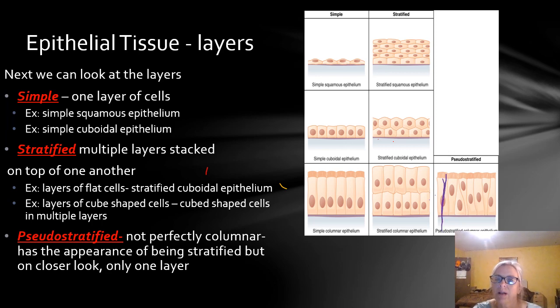These are all one cell here. Each one of these is one cell. It's not divided into cells like this picture here on the other side. So this is pseudostratified, and truthfully it is ciliated, so we would say pseudostratified columnar ciliated epithelium. All right, and so you need to learn what these words mean, and it's really going to help you to understand and know what you're looking for and what you're looking at, how to identify it.